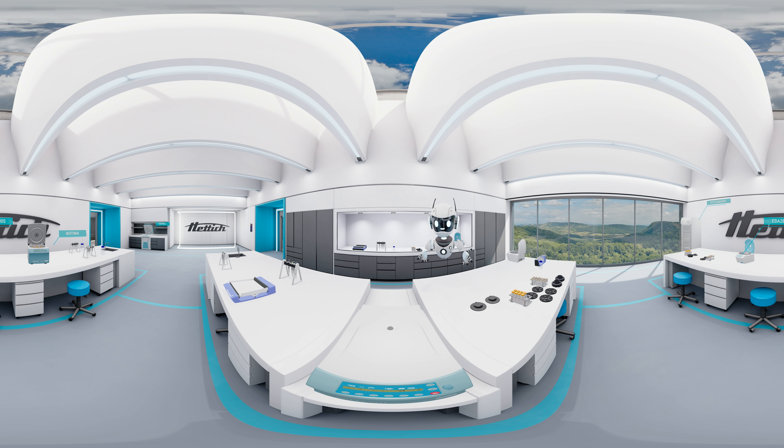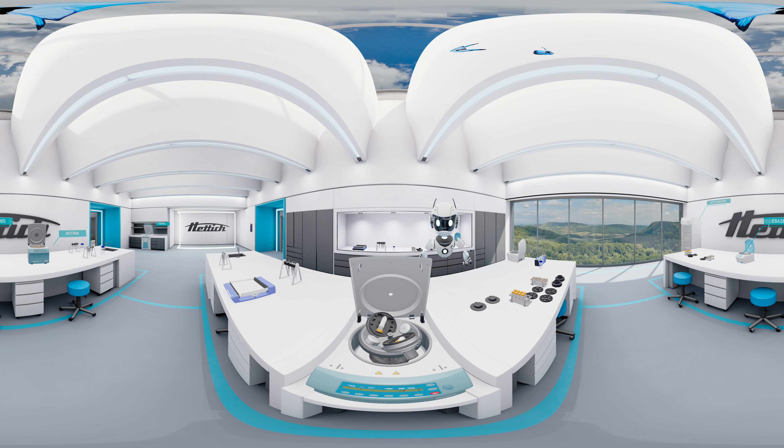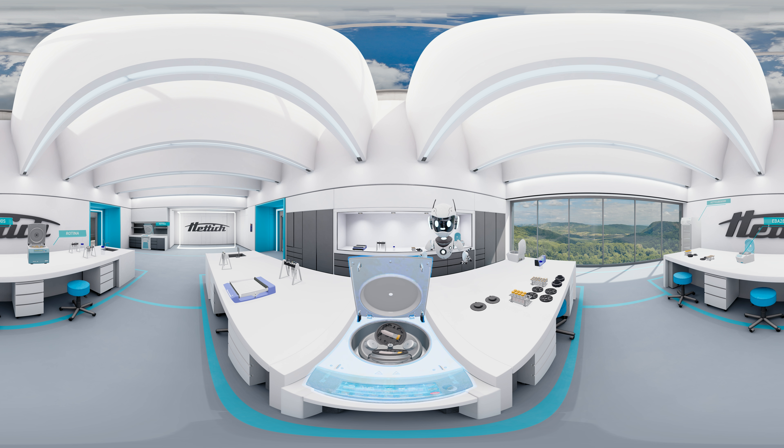This is the new dual centrifuge Zentromix 380R, which has been designed to make challenging laboratory tasks much more efficient, faster, and easier, or indeed to make those tasks possible for the first time. Examples for these tasks are the rapid mixing of viscous materials, fast and effective extractions, the production of nanoparticles in closed and sterile vials, or the widely used process of tissue disruption. A particular advantage is the powerful cooling system for temperature sensitive samples and the low noise level.